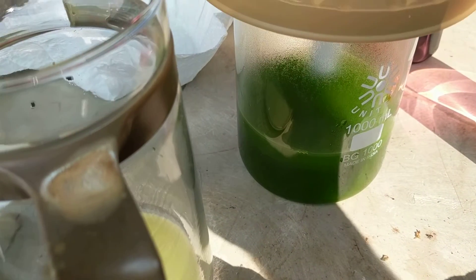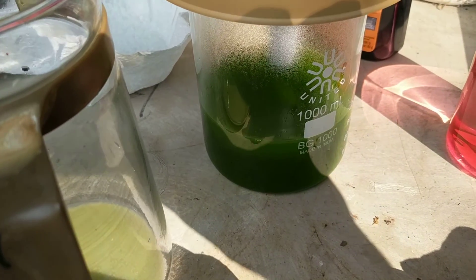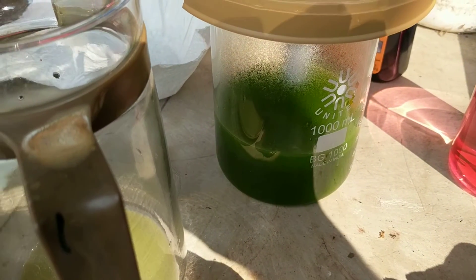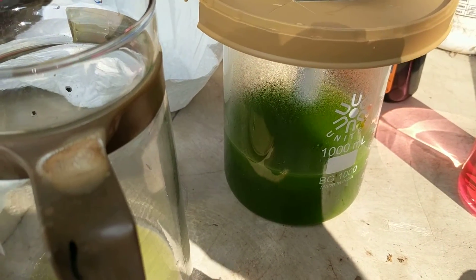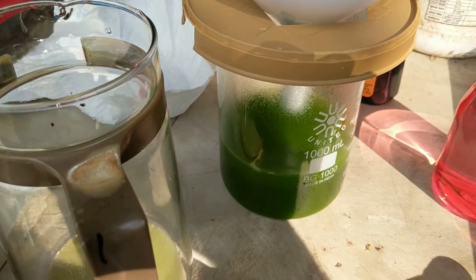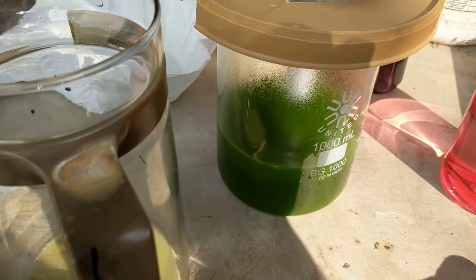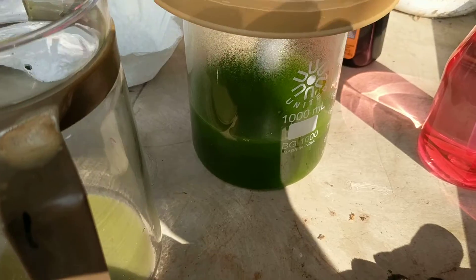Then I'm gonna hit it with sulfamic to kill the nitric, and then I'm gonna hit it with sulfuric to drop any more lead sulfate out that might be in there. At that point we'll be ready to drop it.